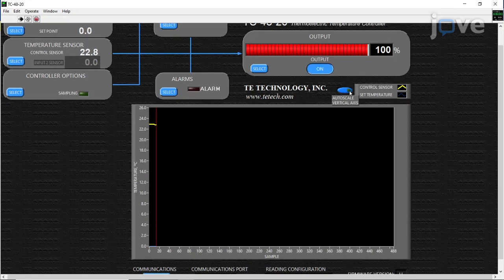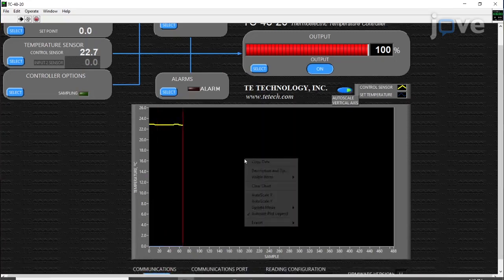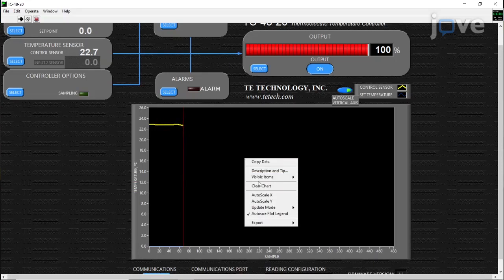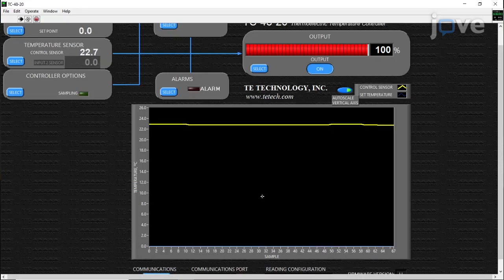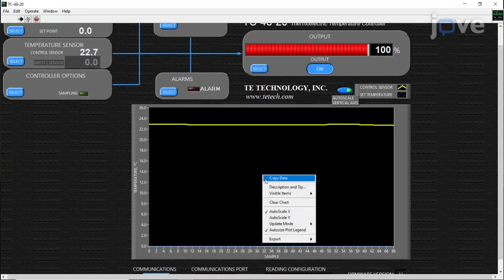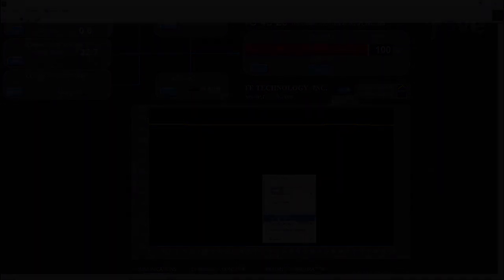Click on the oval button next to the company logo labeled Auto Scale. Note the yellow line that shows the temperature readout. Inside the plot area, right-click to adjust the plot to your liking, such as the scaling.